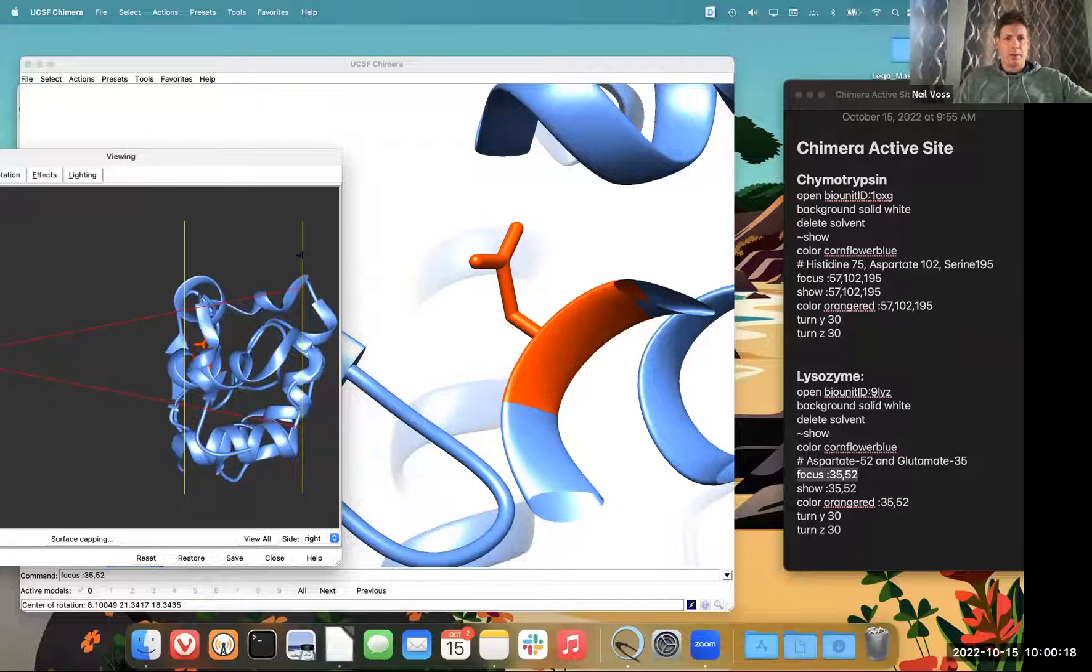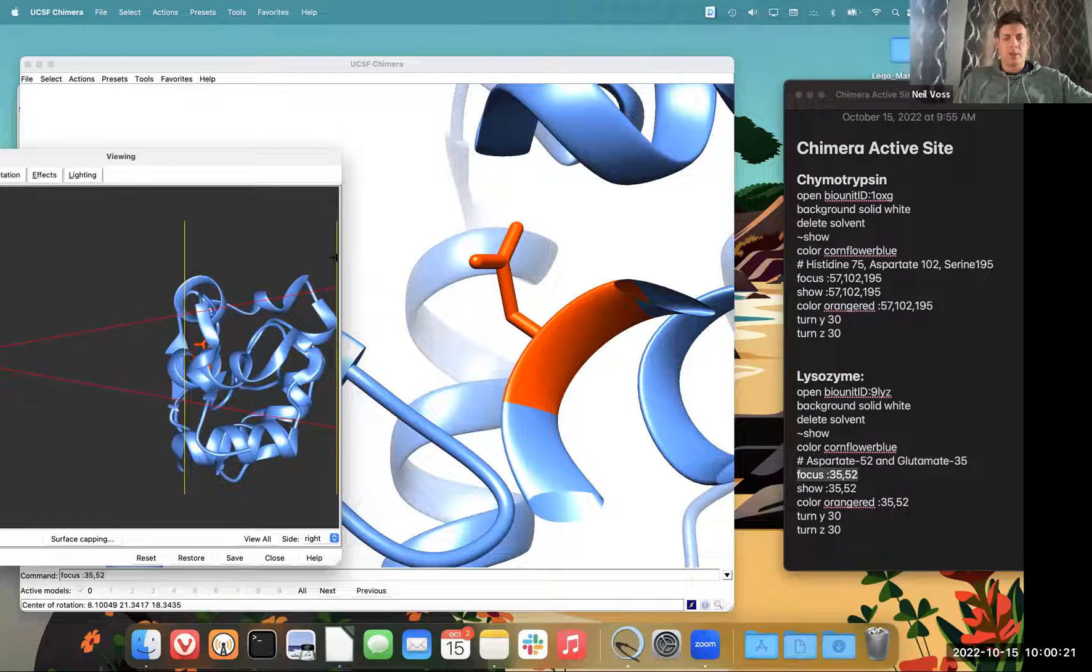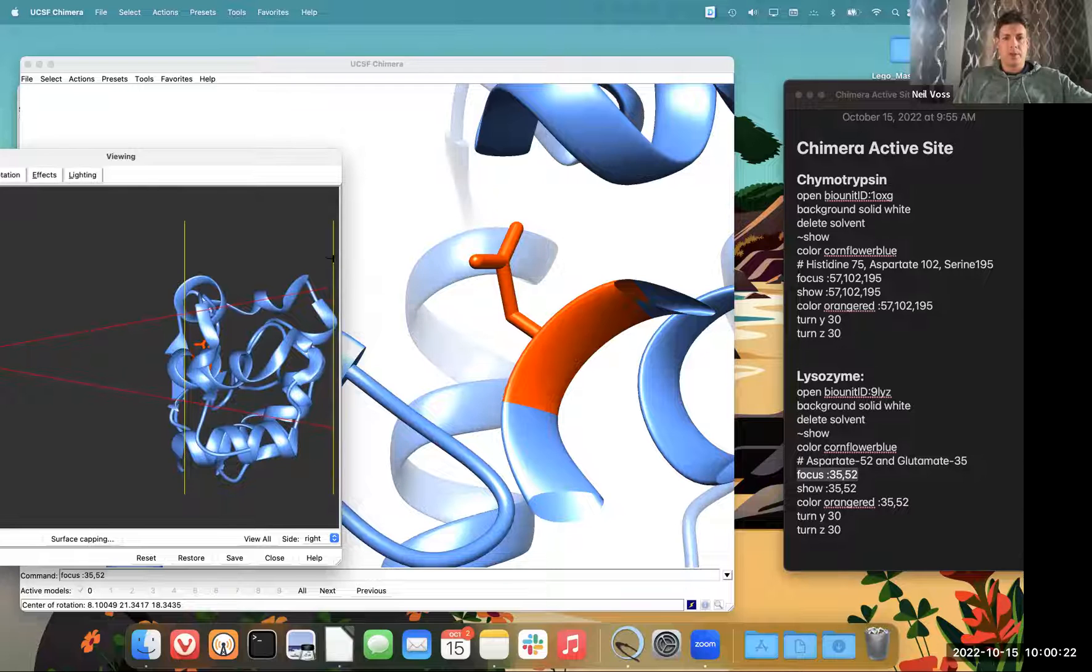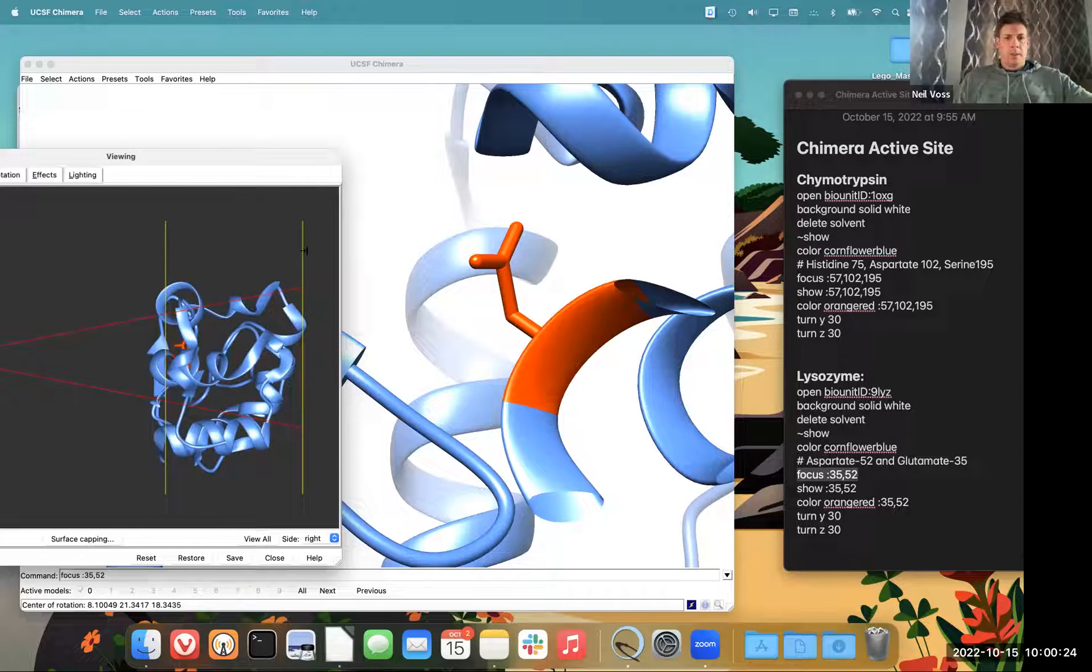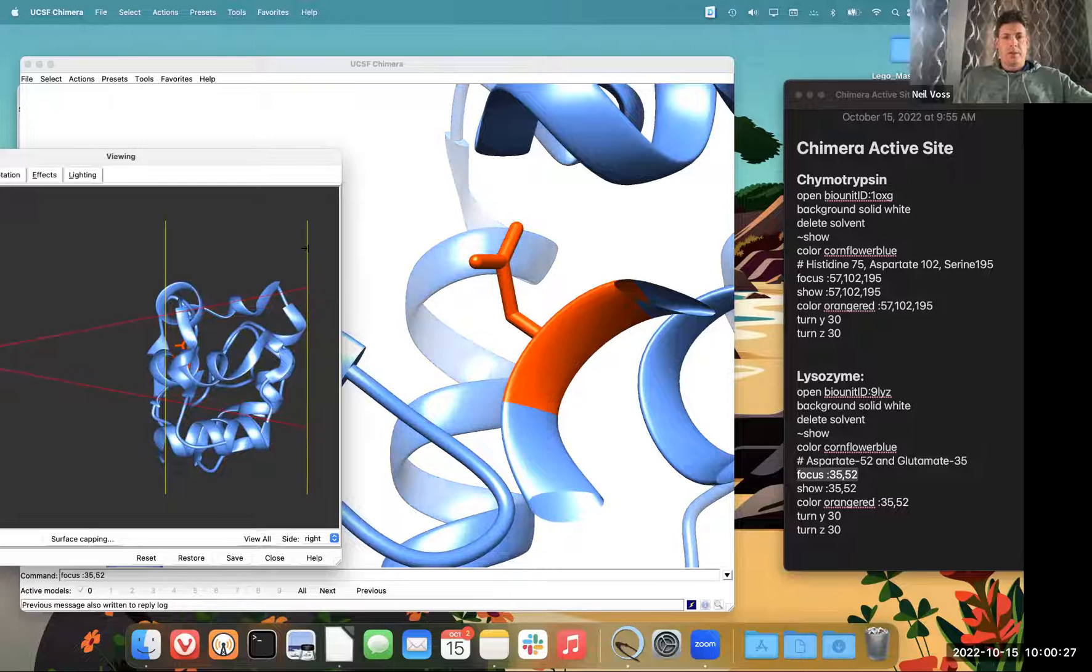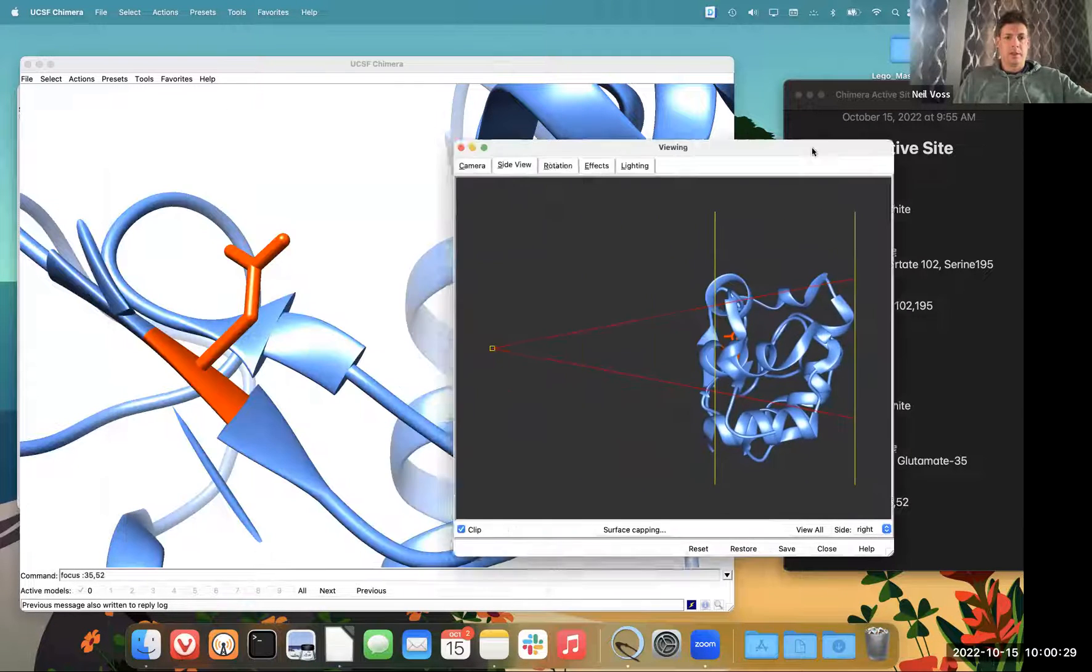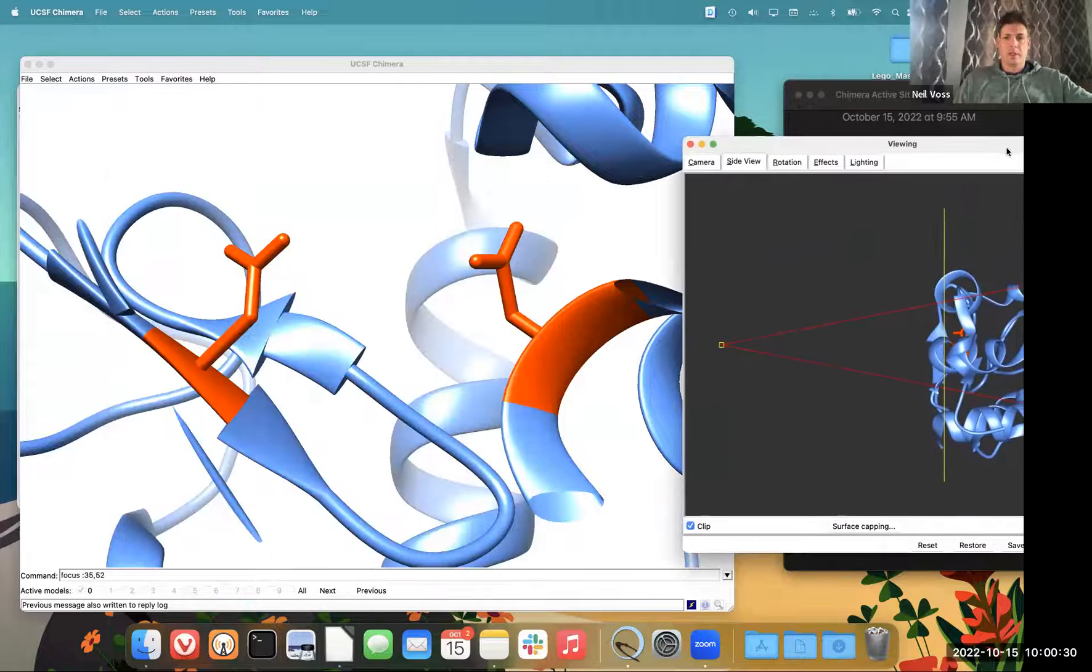I think I want to include the back helix, but not too much of it. We don't want it to block our view. Like if I do it all that, that's too solid. But if I bring it in and make it fade away a little bit, that's pretty good.